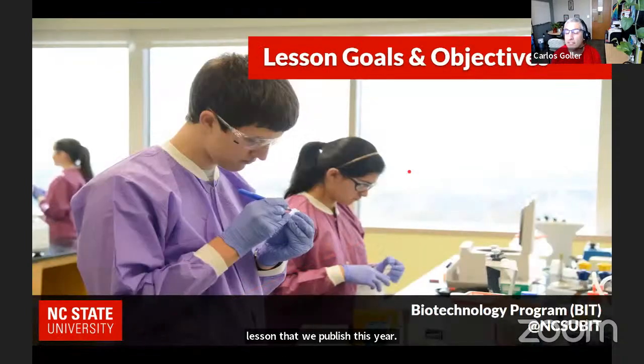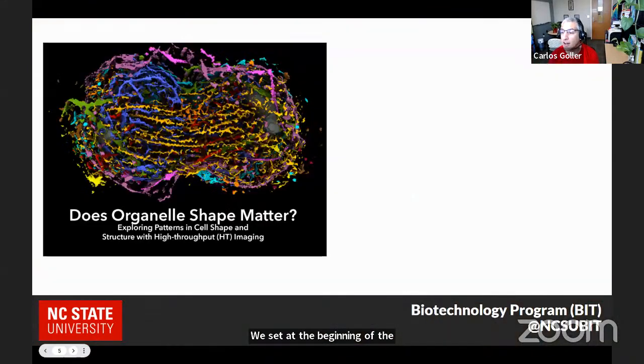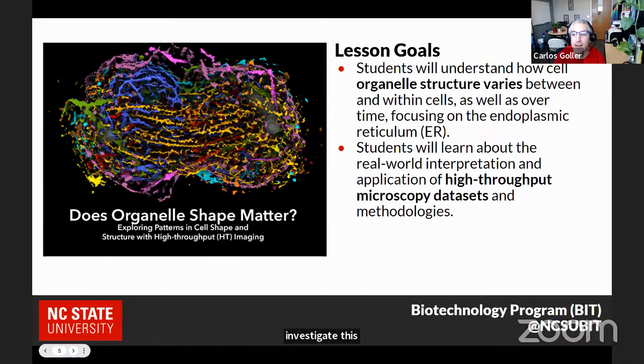So the lesson has some goals and objectives we set at the beginning of the creation process. And these are, first of all, we wanted to introduce students to how organelle structure varies and how we can use high content or high throughput approaches and data sets to investigate this question.